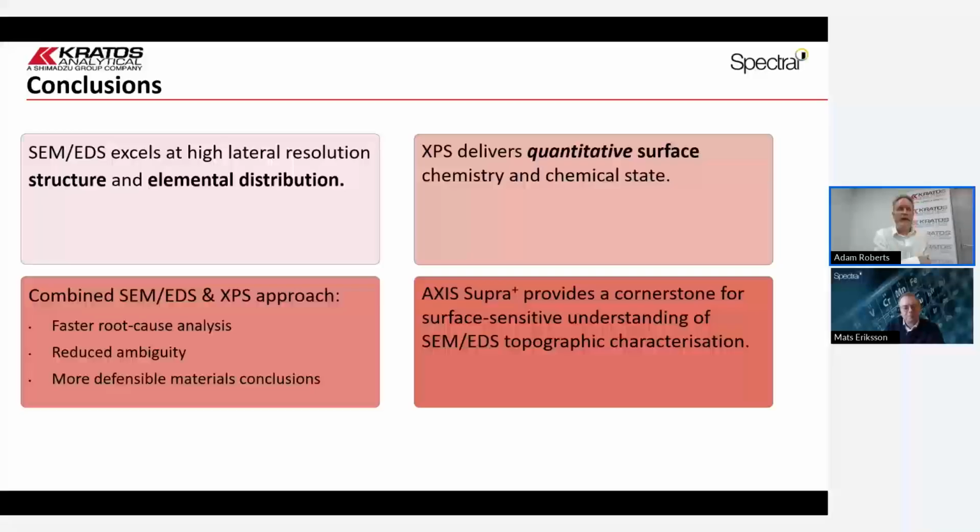We do have to use what we call a relative sensitivity factor, and you can think of that as essentially the probability of creating that photoelectron. So each core level will have a relative sensitivity factor, which is relative to typically carbon, sometimes fluorine, and then we say the probability of creating an aluminium 2p photoelectron relative to the platinum is a half.